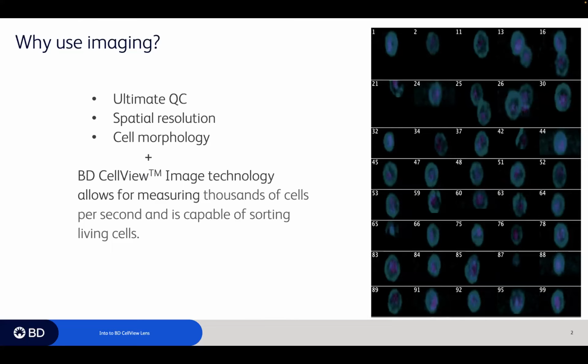In any case, I was going to begin with this: at the past CYTO meeting, I watched many presentations where somebody incredibly brilliant presented all kinds of complex math to ascertain and confirm some aspect of their flow cytometric measurements. Is this actually a single cell?